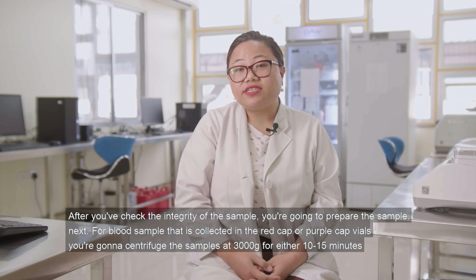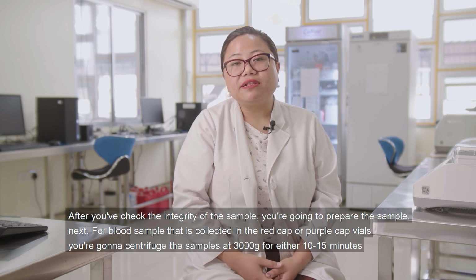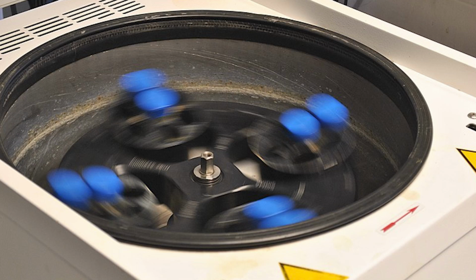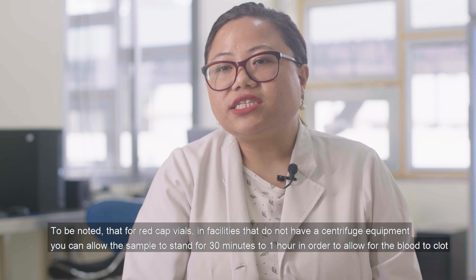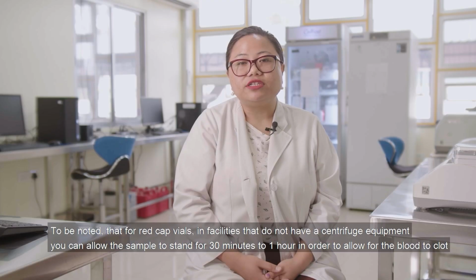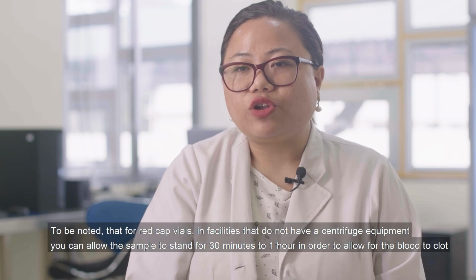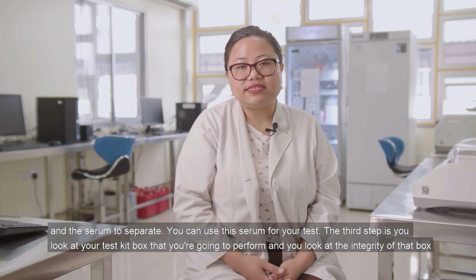After you have checked the integrity of the sample, you're going to prepare the sample next. For blood samples collected in red capped or purple capped vials, you're going to centrifuge the samples at 3000 G for 10 to 15 minutes. To be noted that for red capped vials, in facilities that do not have a centrifuge, you can allow the sample to stand for 30 minutes to 1 hour in order to allow the blood to clot and the serum to separate. You can use this serum for your test.